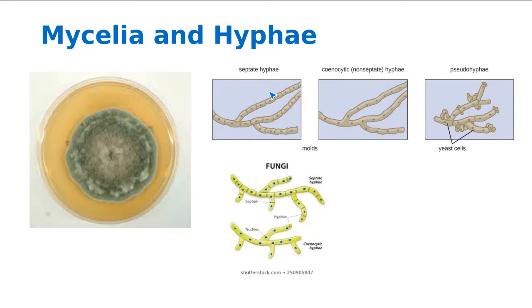Now that's just an idiosyncratic thing that happens to some people who talk about these things. They call mycelia hypha, but a hypha is an individual cell. So one of these cells is a hypha, but the entire thing is mycelia. Okay? So this is septate, but this one is aseptate. There are no cross walls.